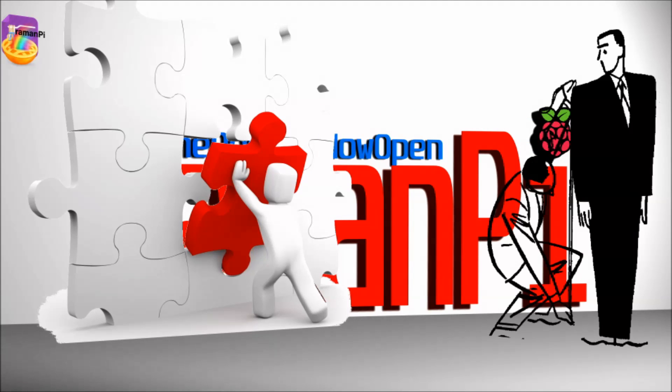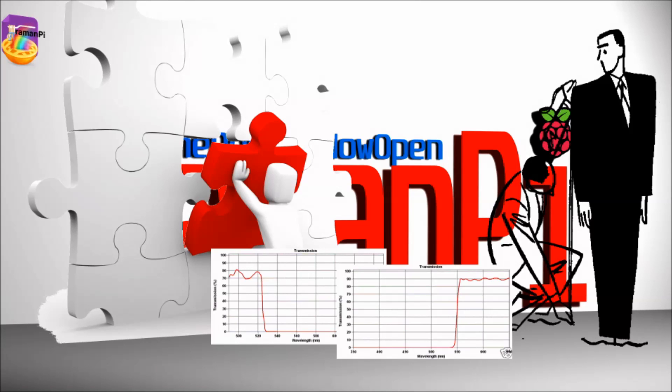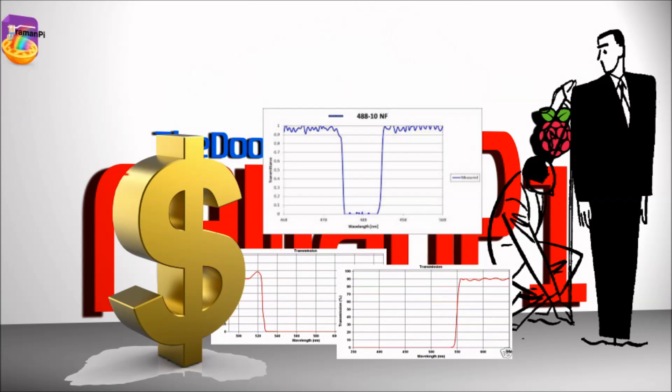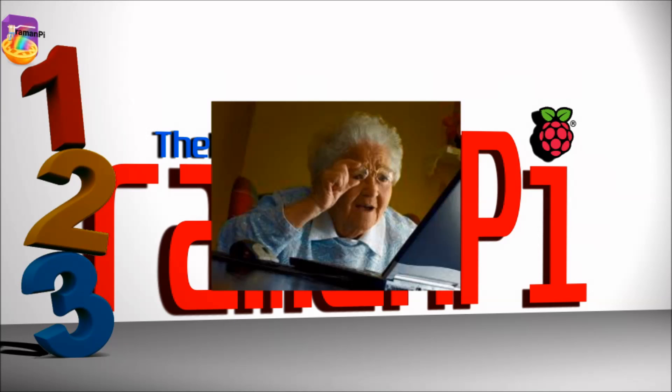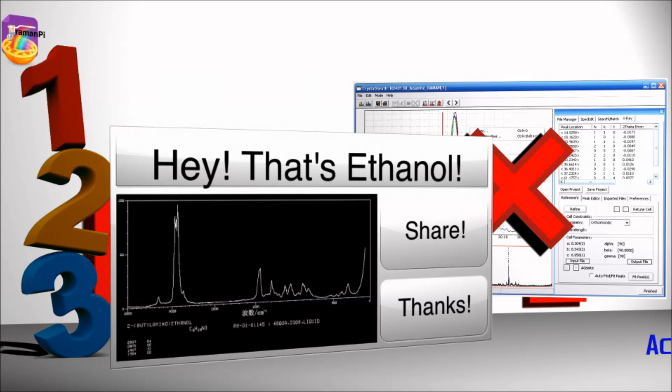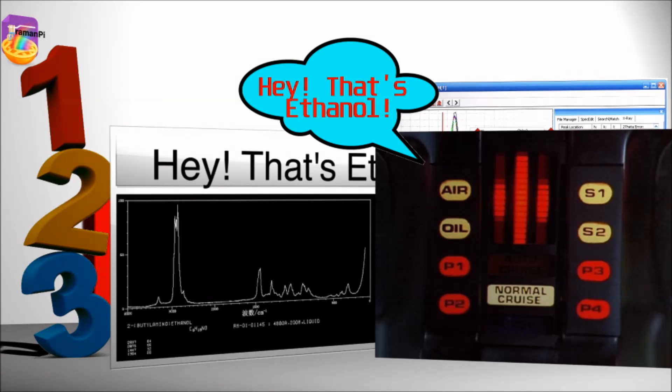The modularity and ability to modify and tailor the parts to suit your needs, plus the use of two inexpensive edge filters as opposed to one expensive notch filter, are a testament to the innovation. The spectrometer has been called a work of art — there's really nothing else like it; not even commercial systems have this many features. I made sure to design every part of the device so that my own mother could use it. The interface is very simple to understand and easy to get up and running with spectra right away — you don't even need to interpret a squiggly line. The system will verbally speak the compound identification to you when it is identified.